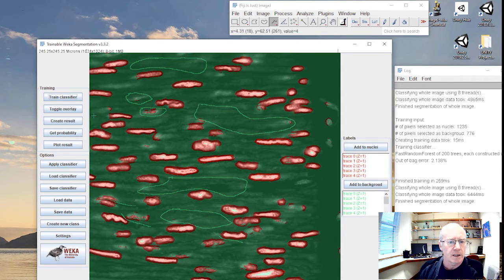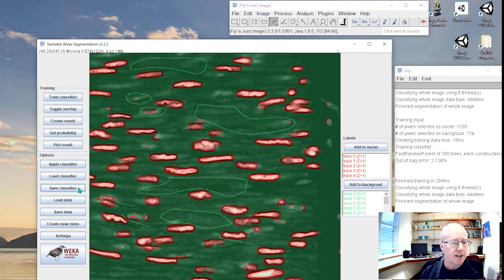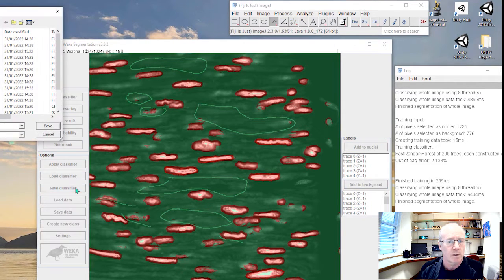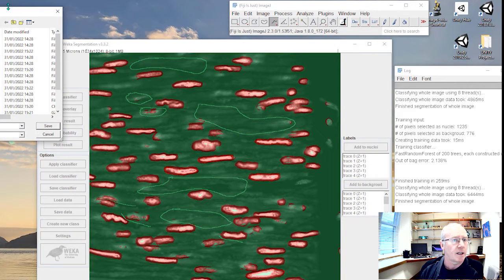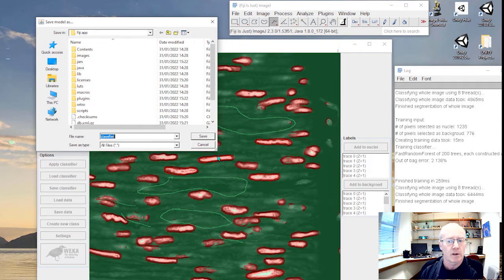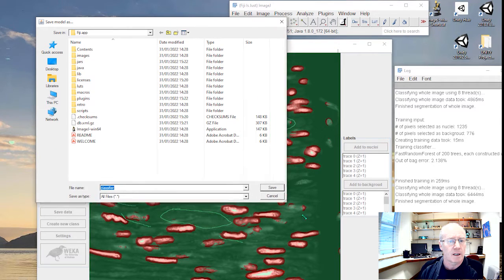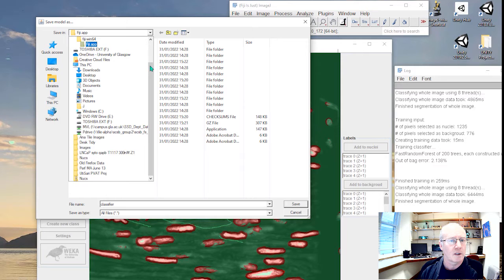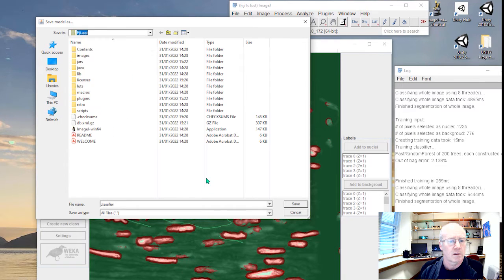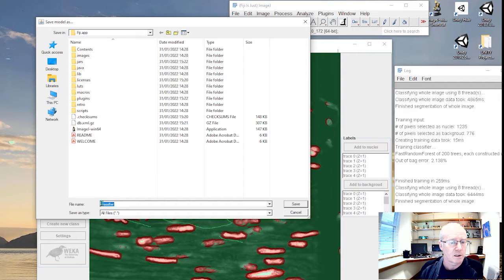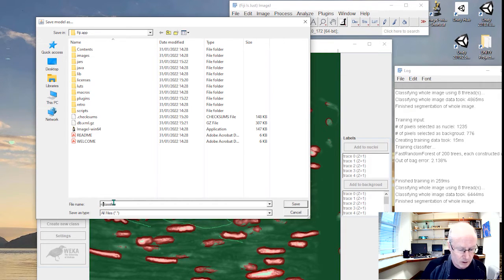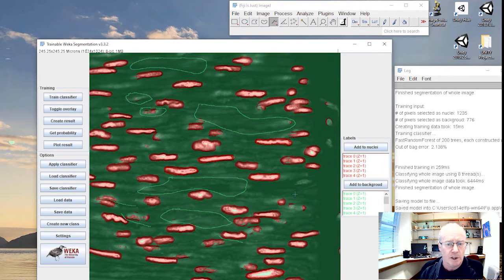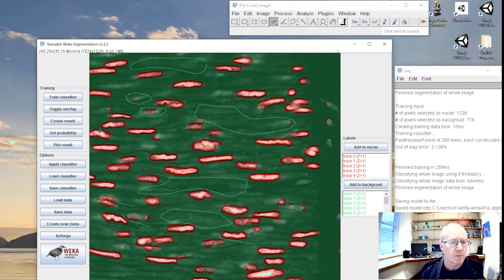Let's save that classifier. I'm going to give it a name. Let's save it in my Fiji app. I'm just going to call this nuclear classifier. We've saved it.